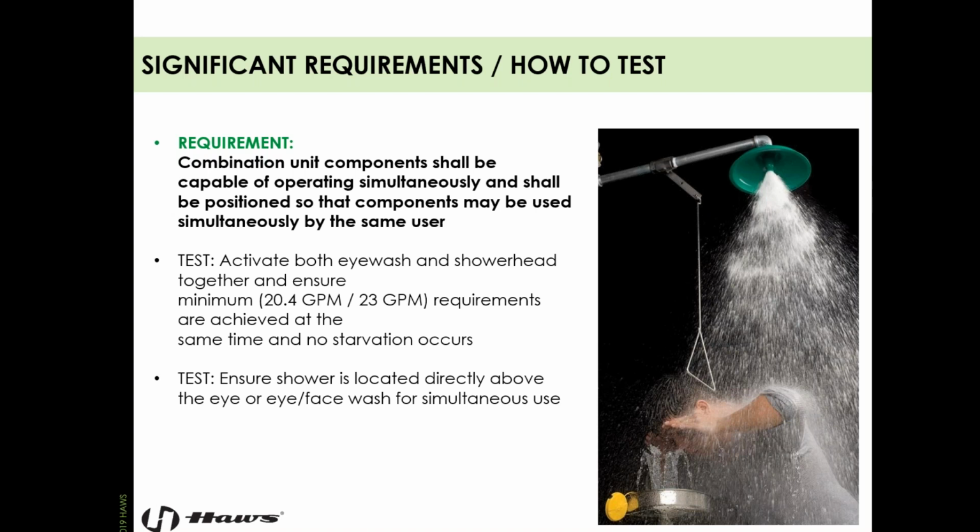But I threw away the instructions, and you have to follow the manufacturer's instruction guidelines, especially for something as important as this, or a crib. And they think that the shower is for one emergency, the eye face wash is for another emergency, and that's not the case. These have to be used by the same person at the same time. It's incredibly important, okay? Just make sure they're correctly aligned, one over the other, and that's very easy to check.